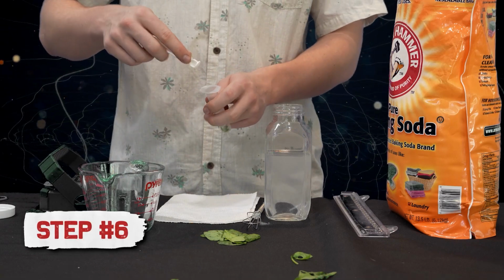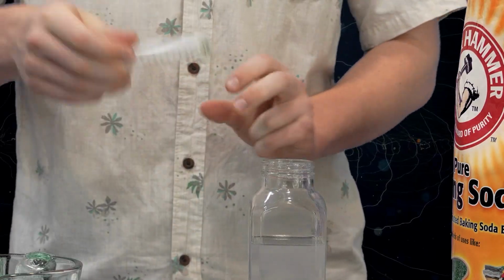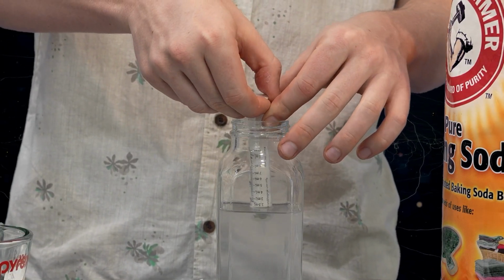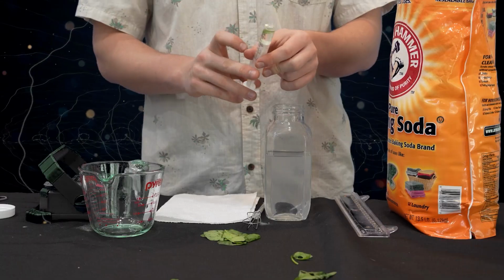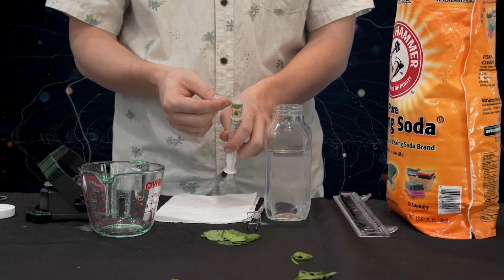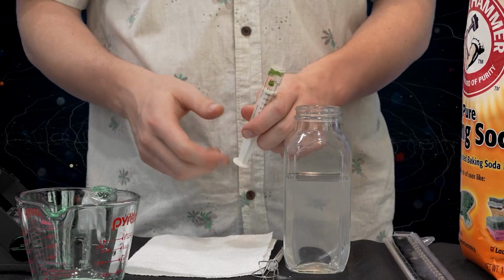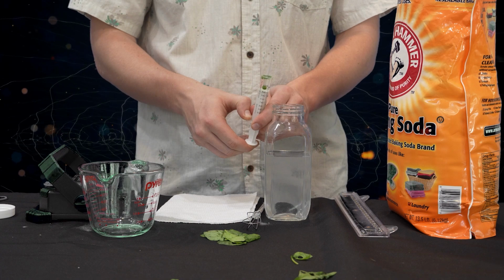Step 6 is going to be to fill your syringe up with water, but not that much. So I'm going to take my syringe, insert it into the water that we've already made, and fill it up to about the 5 milliliter line. And you want to make sure that when you're doing it, there is absolutely no air inside of the syringe. So I'm going to press on the bottom here. A little bit of air was just coming out there.